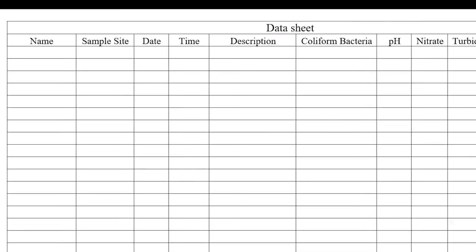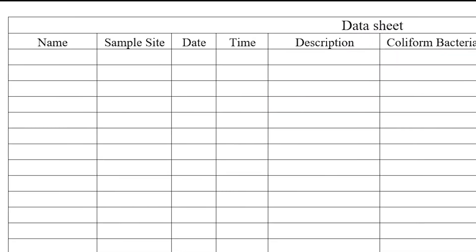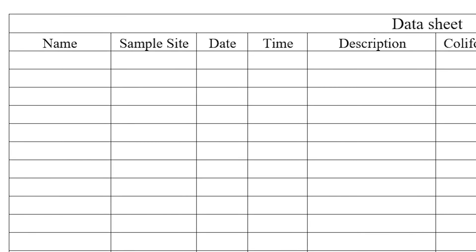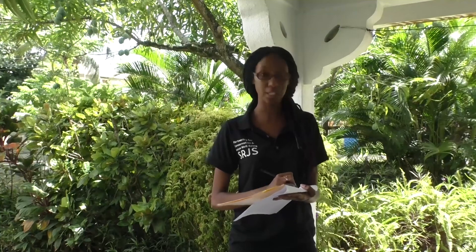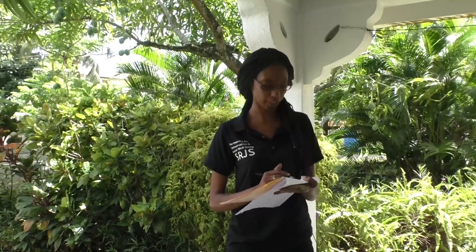Before we get into the actual tests, there's some information we need to fill in to this data sheet. The first thing here is the name of the tester. My name is Benita Davis, so I'll write that down here. Then the sample site — since the sample site is located in my yard and it's a black tank, I'll write 'black tank, Benita Davis's yard.'